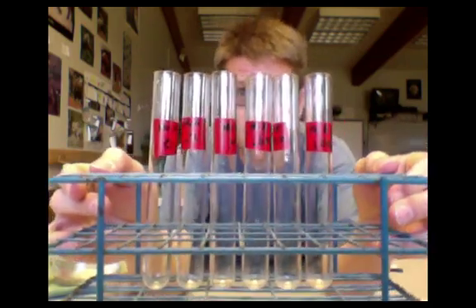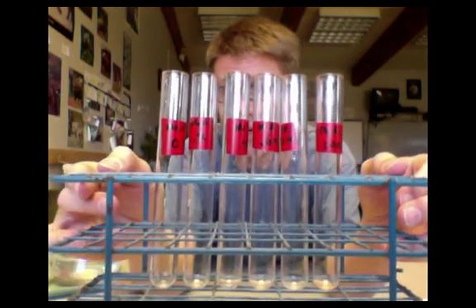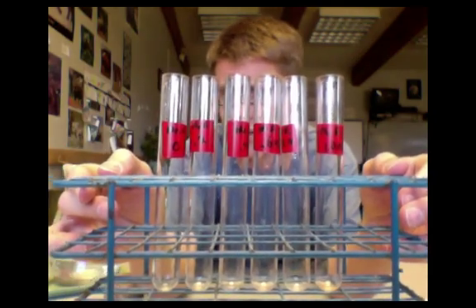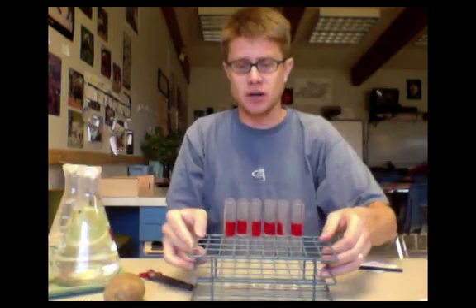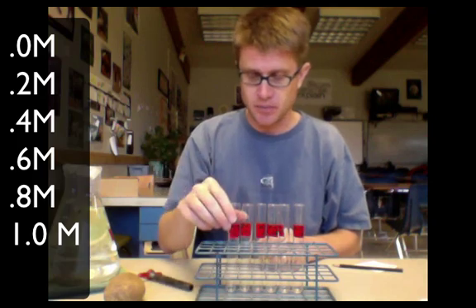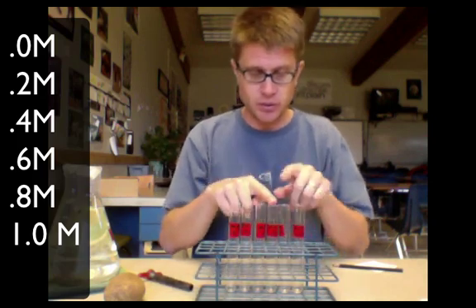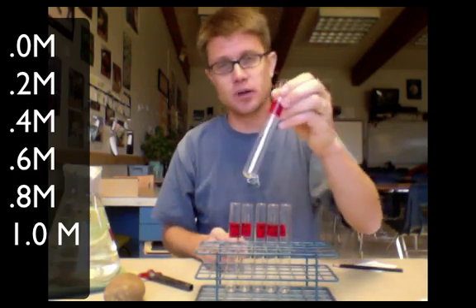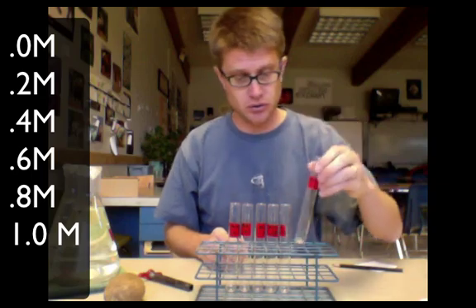These six different test tubes I've already labeled. They've got my name on it and the different concentrations of sucrose. We're going to start with zero molar sucrose, which is essentially distilled water. We're going to go 0.2, 0.4, 0.6, 0.8, and finally we're going to work our way up to 1.0 molar sucrose solution.